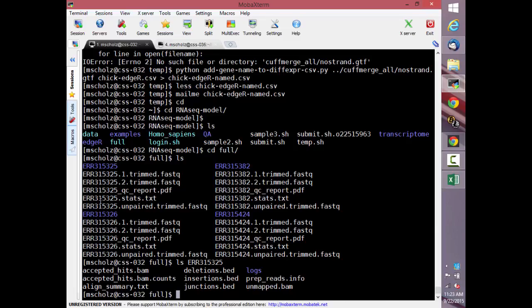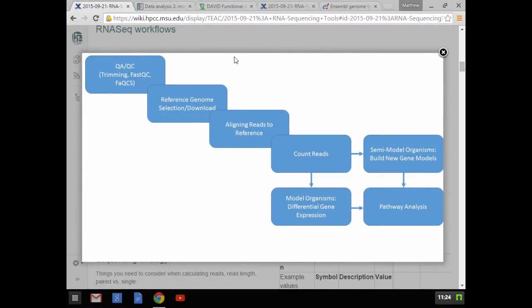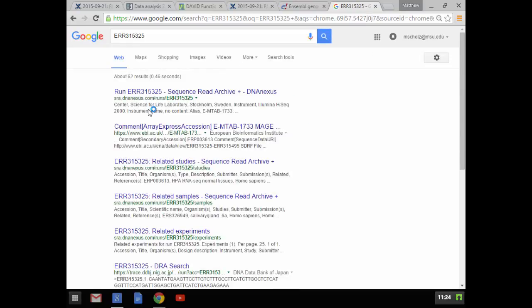So what I didn't do, because I am a terrible person, is actually go back and validate that each one of these names is what I think they are. So the first thing I'm going to do is do this the hard way. Just hold on that back. And we're going to go to Ensembl. We'll just search that way.